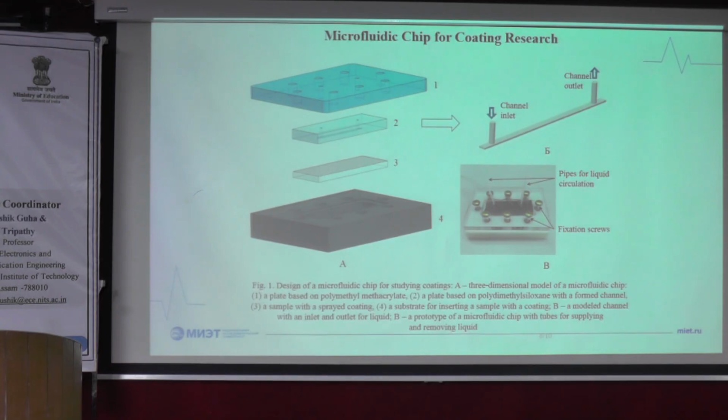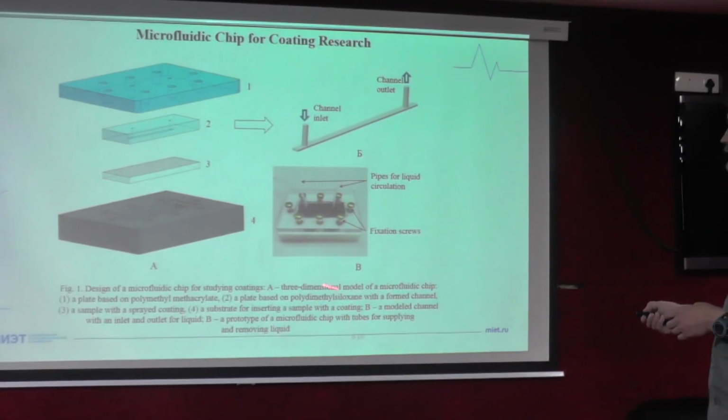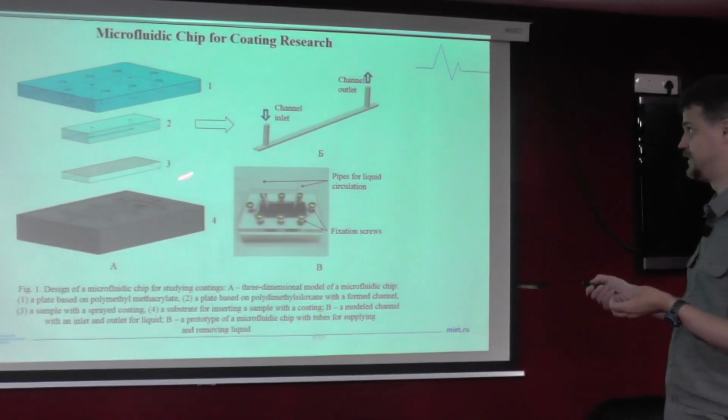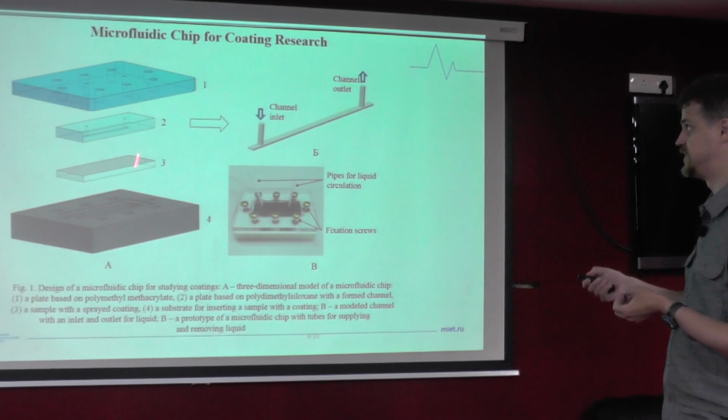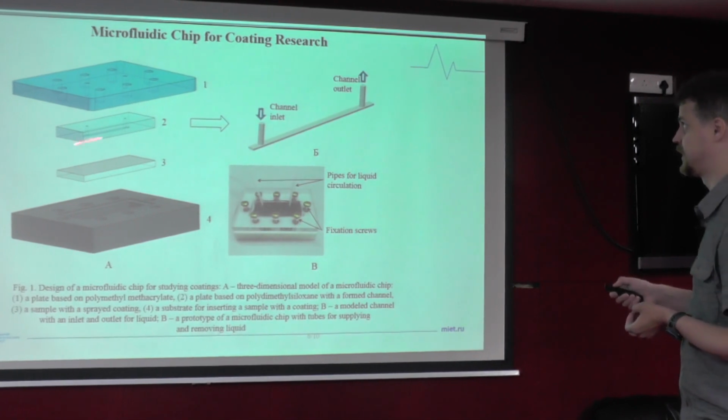So there was basically a scaffold for that, where we just created the form for the microfluidic flow that we wanted to implement inside of this particular material. And then we just added the material that created a specific form of the microfluidic channel. And that's the experimental surface that we're working with.